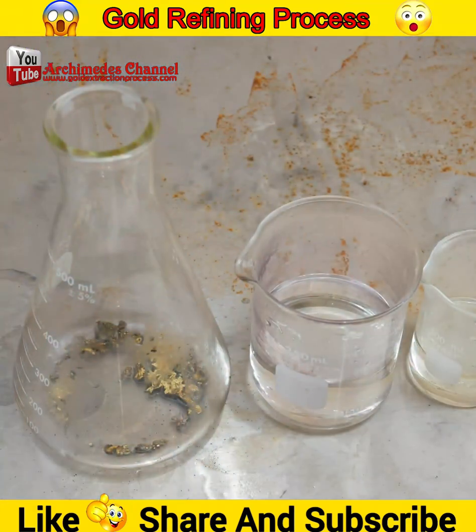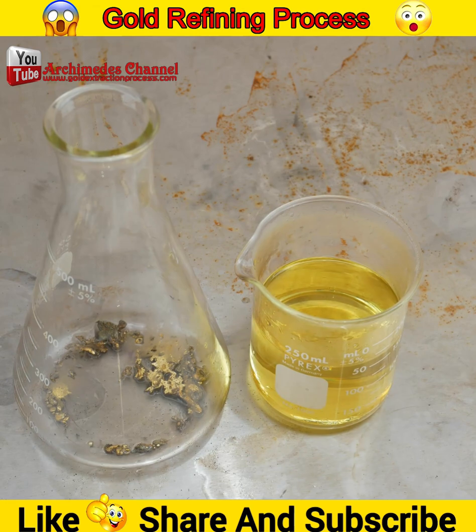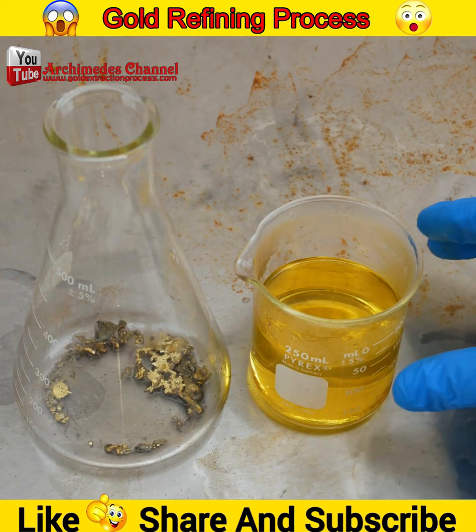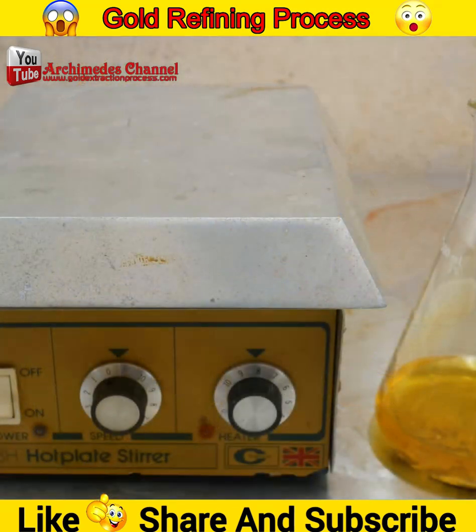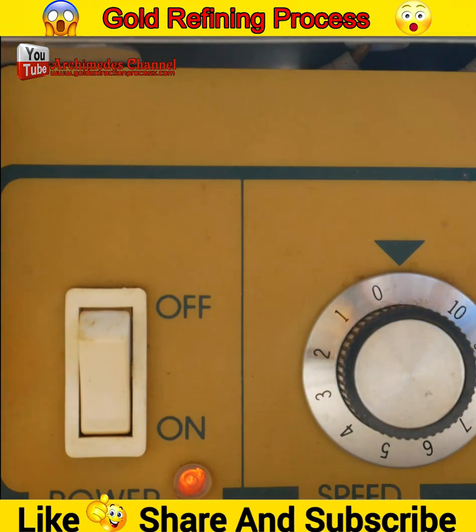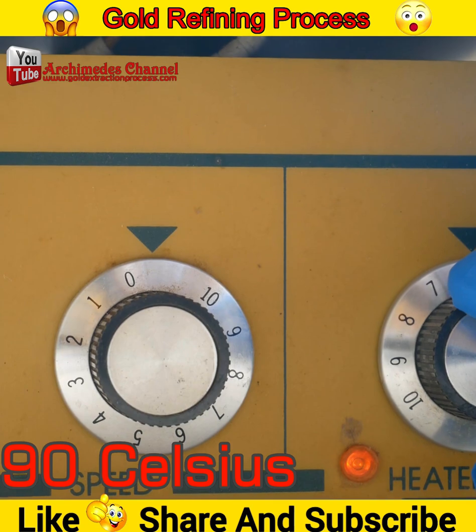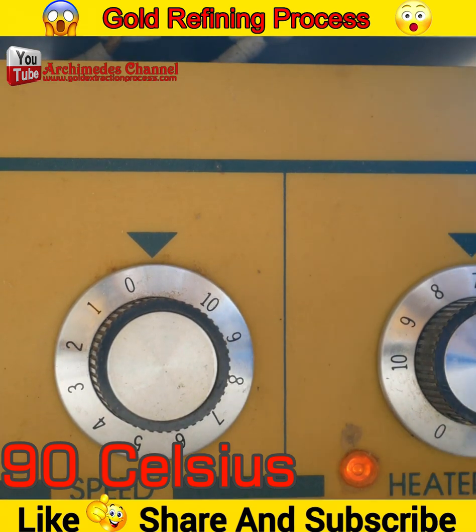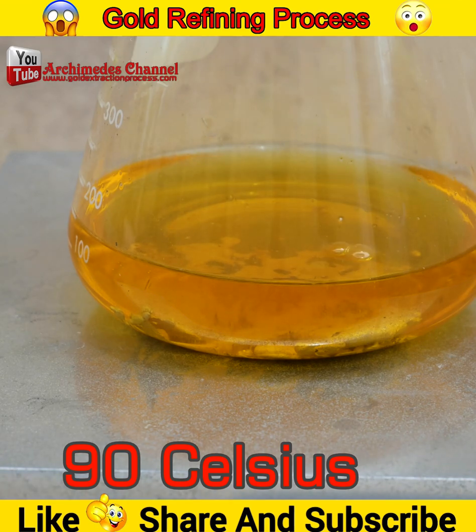Aqua regia is composed of two chemical substances: one part nitric acid and three parts hydrochloric acid mixed together. For the ratio between gold alloy and aqua regia: use 50 grams of gold alloy with 200 milliliters of aqua regia. From my experiment, when gold alloy is dissolved at a temperature of 90°C to reach saturation point, it should neutralize easily to make gold precipitation.